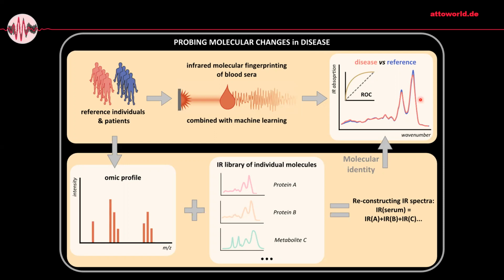You might ask me, of course, if the omic profile can do that, then why would we do the infrared spectroscopy? And the answer is simple: it's quick and fast. It's a simple measurement, 3-4 minutes, and there is no sample preparation whatsoever. You take the freshly prepared plasma, put it in the commercial device, get the answer. That would be, I think, a very beautiful future we're aiming for. We are still not there though, because there is still a way to go to show that this is clinically applicable.